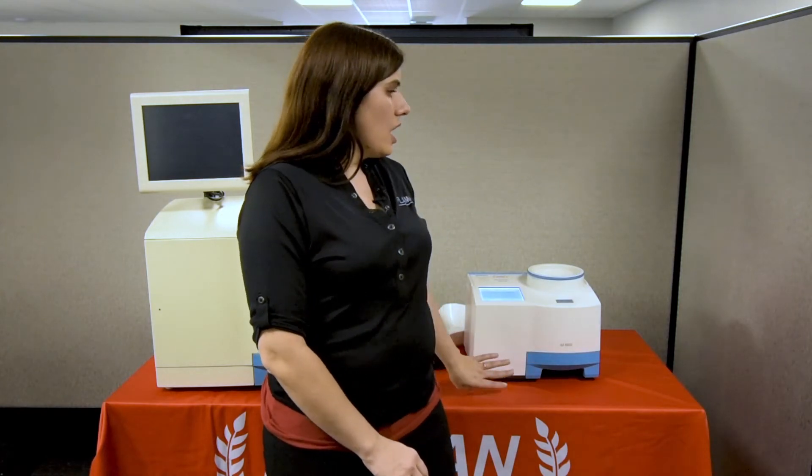There is an optional GPS module that you can put onto this unit, and it can help you do protein mapping of your fields so you can determine where the best place to combine your grain will be.